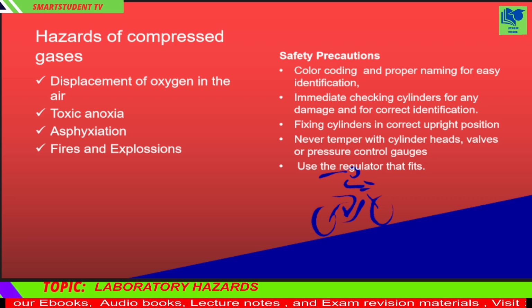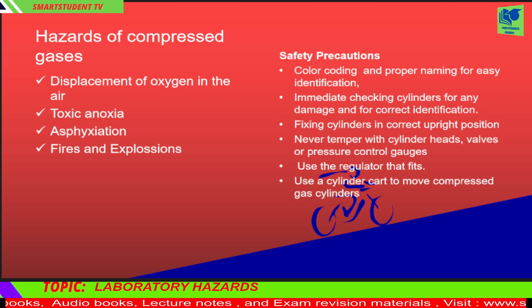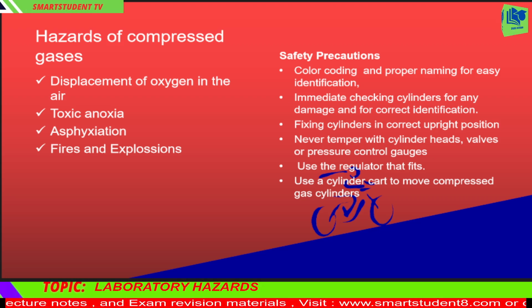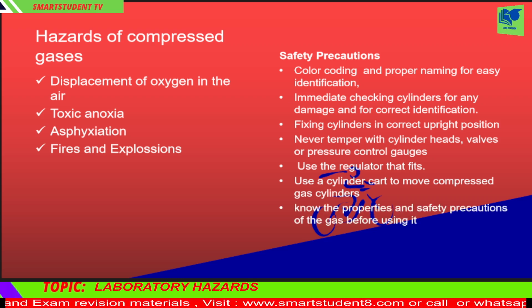Use the regulator that fits. 7. Always use a cylinder cart to move compressed gas cylinders from one location to another, and always secure the cylinder to the cart with a chain or strap and buckle. 8. Do not drop cylinders. Do not allow cylinders to strike each other.